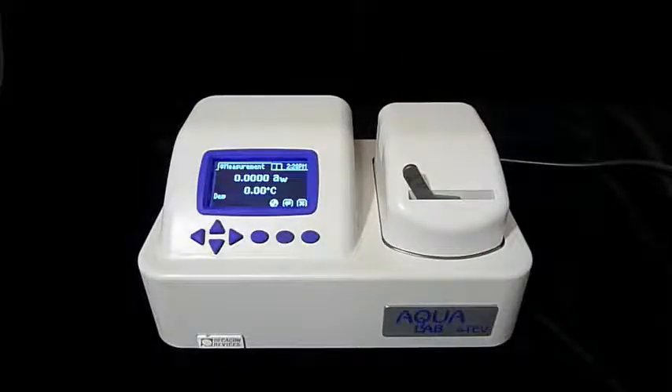Lock the chamber by pushing the chamber lock lever to the left. After a minute or two, the Series 4 will show an initial water activity for our graham cracker sample. This reading is preliminary and will change. The Series 4 will continue to make water activity readings until successive readings show that your sample has reached equilibrium. While we're waiting for this to happen, let's take a look at how to prepare several different types of samples.